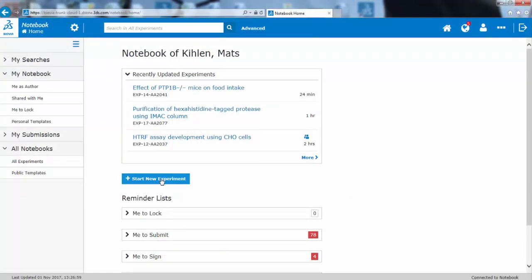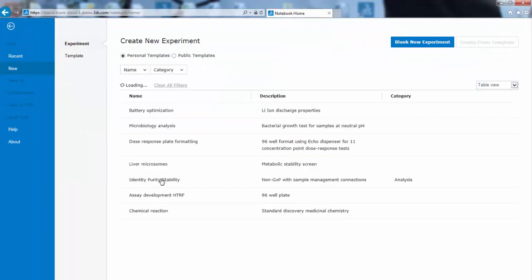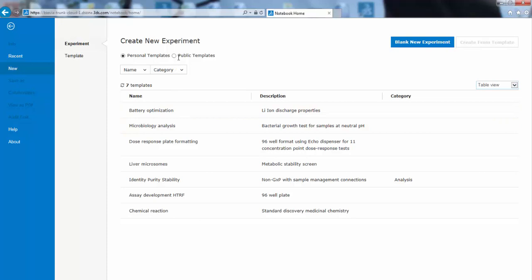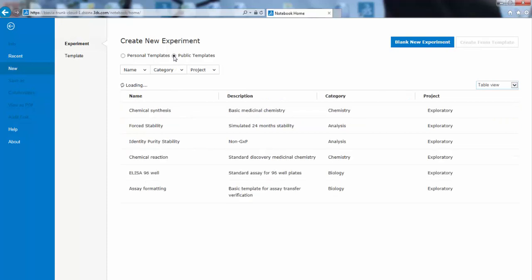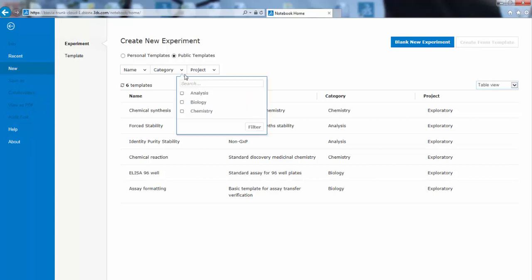In the web client, the corresponding functions are slightly different. Here you start a new experiment, but in this case you get a list of your personal templates or public templates. This list will be preserved between your sessions and you also have the option to filter by categories rather than navigating through the folder structure.